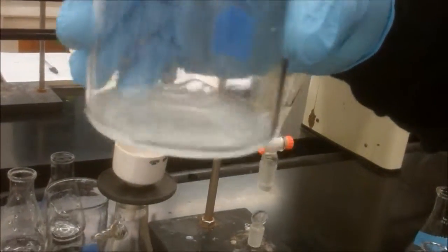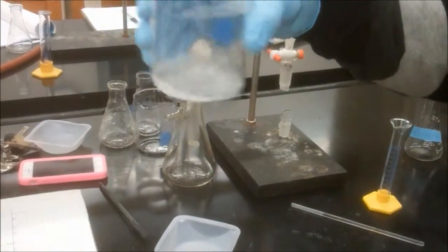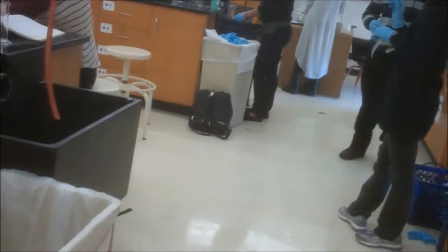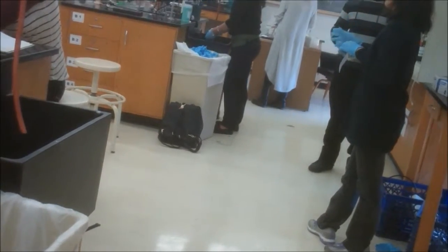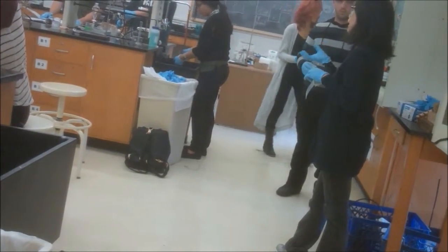You're waiting for all that solid to leave. It's taking quite a while — that's okay. Do recrystallization. When recrystallizing, do not question it.